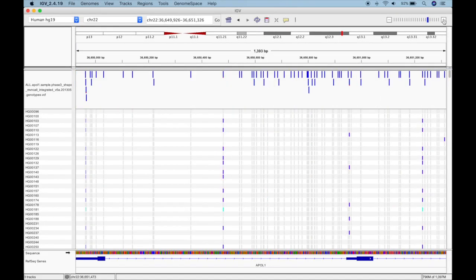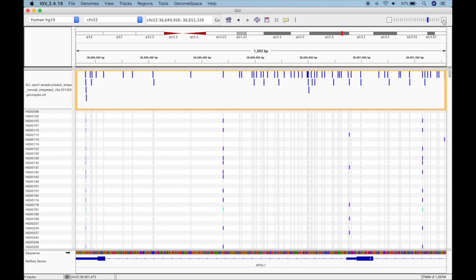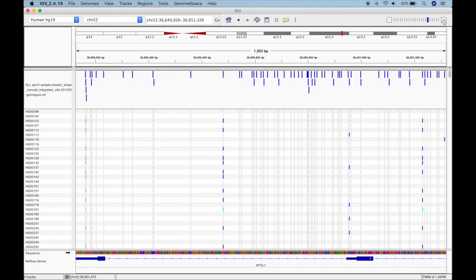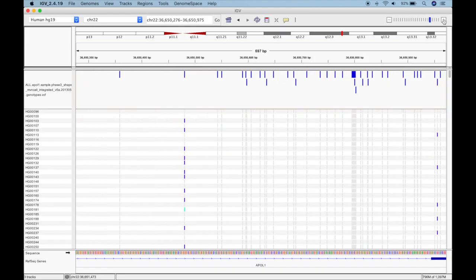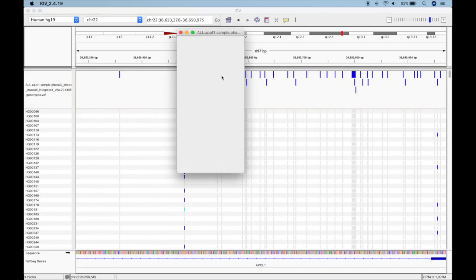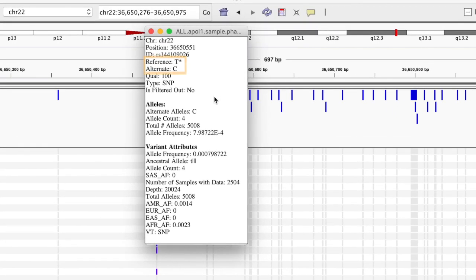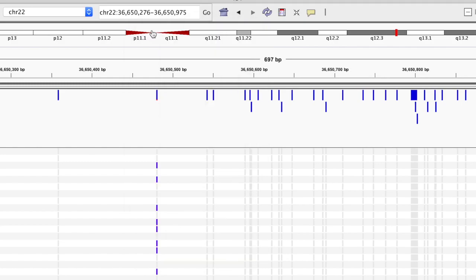The variant information track is made up of colored bars which represent the allele fraction at each variant locus. Red represents the alternate allele and blue represents the reference allele. If you click on an allele fraction bar, you can see a lot of useful information like the reference allele, the alternate allele, and the alternate allele frequency. Notice that some of the allele fraction bars are on lower levels. These levels are actually meaningless and are only there to help with readability in places where variants are tightly packed.